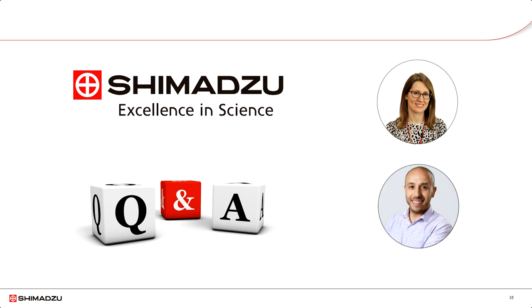All right, so continuing with questions. I think this one is also basic, but it can translate into the application itself if you want to implement those methods. It's related to automation, and it says, can the data acquisition be automated, e.g. for larger sample numbers? Meaning, if you have a lot of samples, do you have to be there and manually record each spot, or can you just create a list and run it?